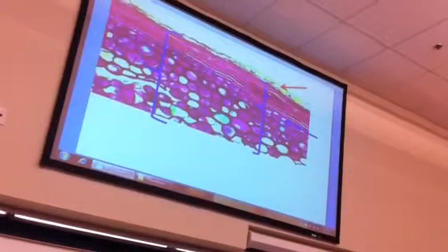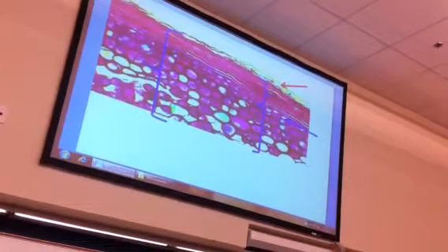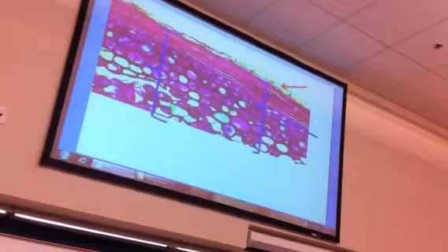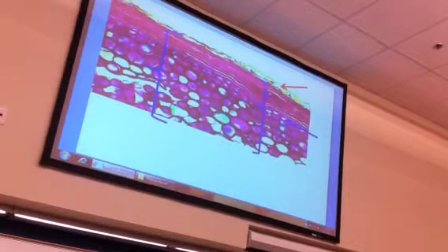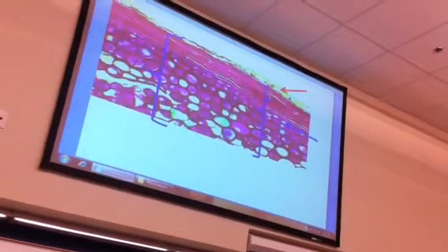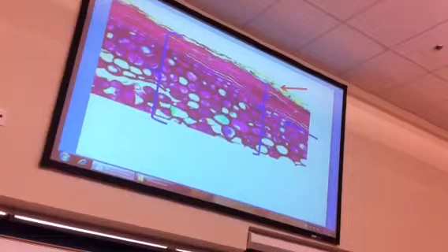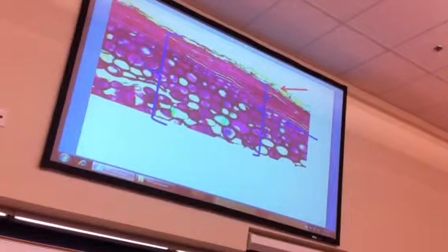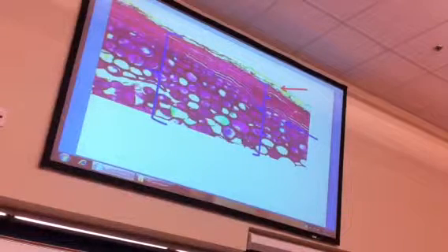But it's replaced by periderm, which is composed of 3 layers. What's the layer here that's distinctly reddish? And the cells are very thin. Cork. And some trees form incredibly thick cork, like we have in the back. Most trees have very thin cork. This is cork parenchyma.